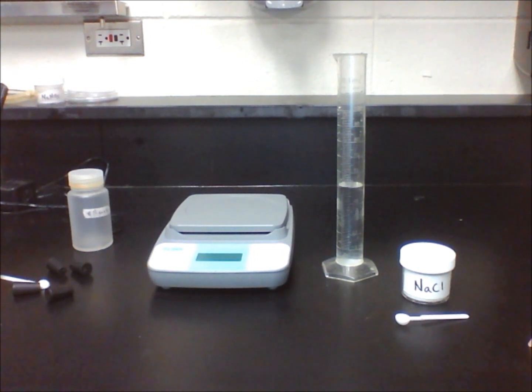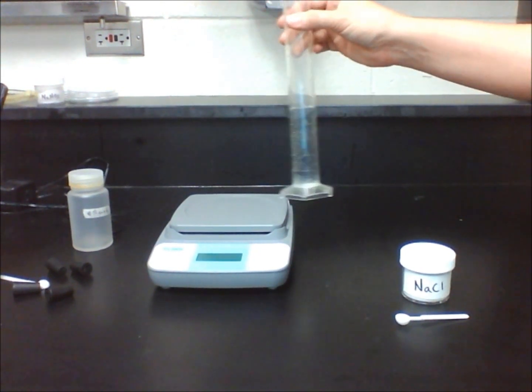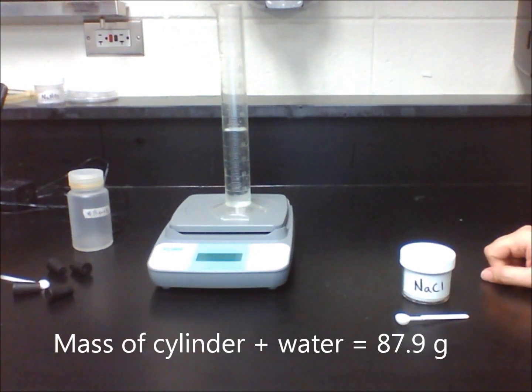First, place 50 milliliters of water into a graduated cylinder. Find the mass of the graduated cylinder and water and then record your results.